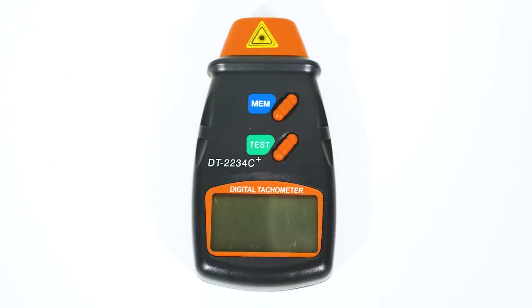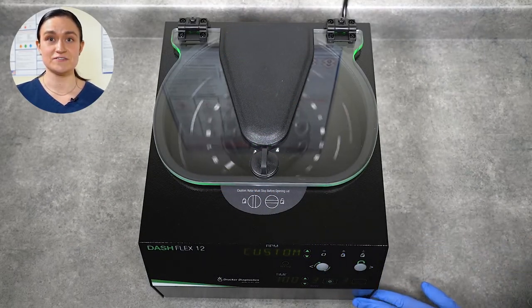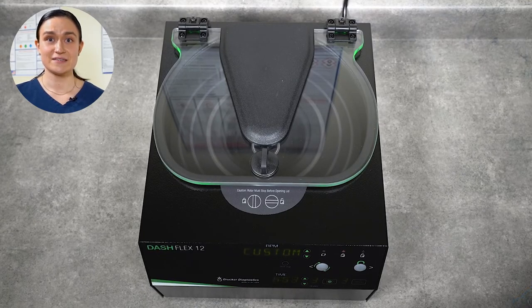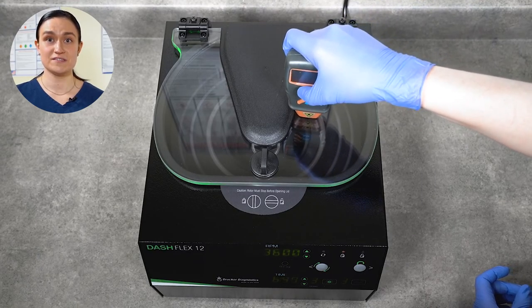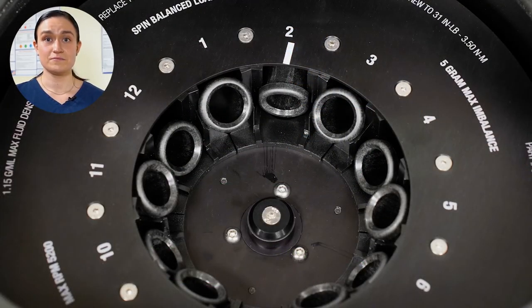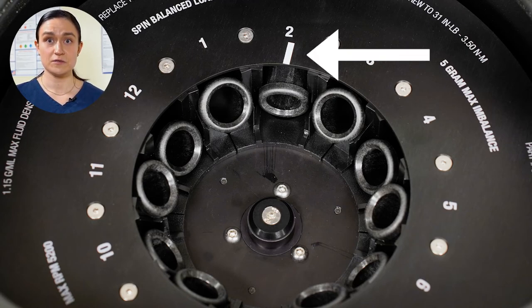Your Dash Flex 12 requires no regular maintenance, but you may wish to verify the centrifuge spin speed. To verify the spin speed, you'll need a photo tachometer like the one shown here — your lab should have a validated photo tachometer for this purpose. With your centrifuge plugged in and turned on, start it running on whatever cycle you would like to test. Give it a minute for the centrifuge to reach its full speed — you'll know it's at full speed when the timer begins counting down. Then use your photo tachometer to point down through the centrifuge lid, aiming for the clear area where you can see right down to the rotor. The Dash Flex 12 rotor has a photo tachometer strip already mounted to it, so no additional strip is needed.